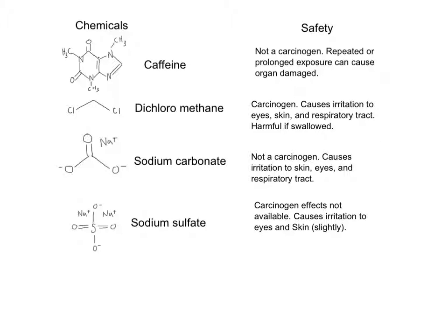Sodium carbonate was used. It is not a carcinogen, however, it causes irritation to skin, eyes, and respiratory tract. Sodium sulfate was also used, for which carcinogen effects were not available. However, it does cause irritation to eye and skin.